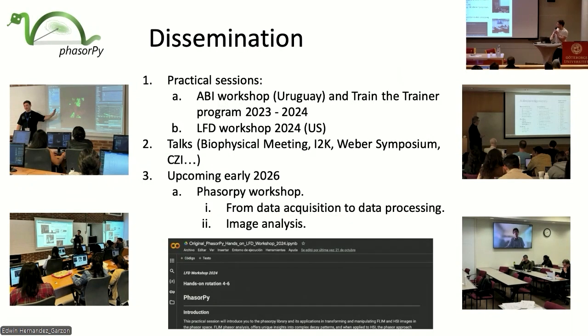So the idea of creating the community was, well, it's an open source library, it's in Python. The idea when we wrote the grant is to create something like scikit-image or NumPy. So please come, put what you are doing in our repository with our contribution guidelines. If you are a user, I mean, if you need to use these codes, write to us, we can help you, because not everybody has someone that programs in their labs.